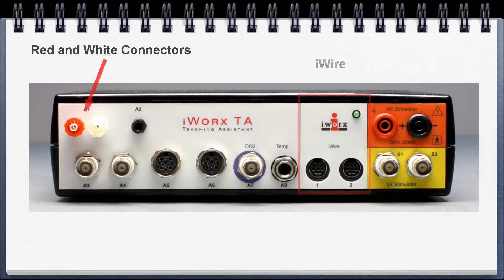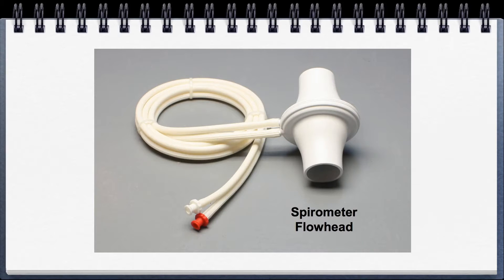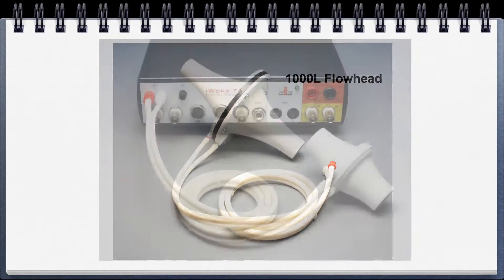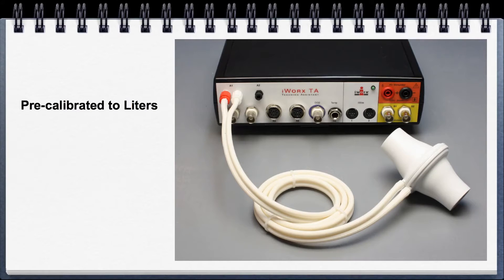Starting on the left with the red and white connectors — this is utilized for the spirometer flow head, and for the exercise physiology teaching kit, the 1000-liter flow head as well. Red goes to red, white goes to white. If you're using the settings file, the smaller flow head is pre-calibrated to liters and takes advantage of the built-in barometer. For the larger flow head, you will have to use the 3-liter calibration syringe.